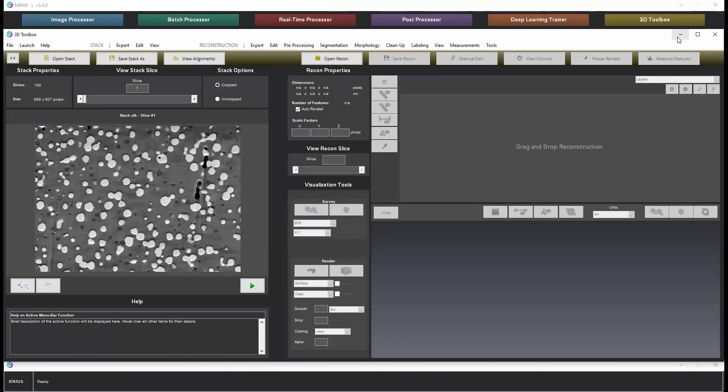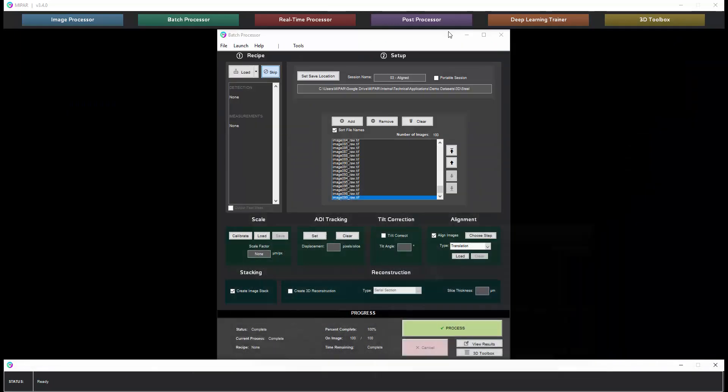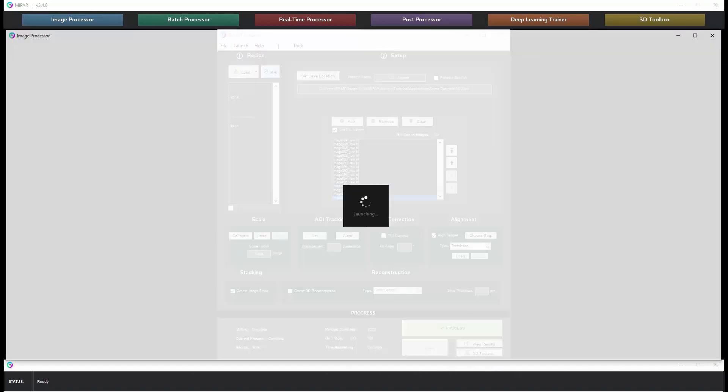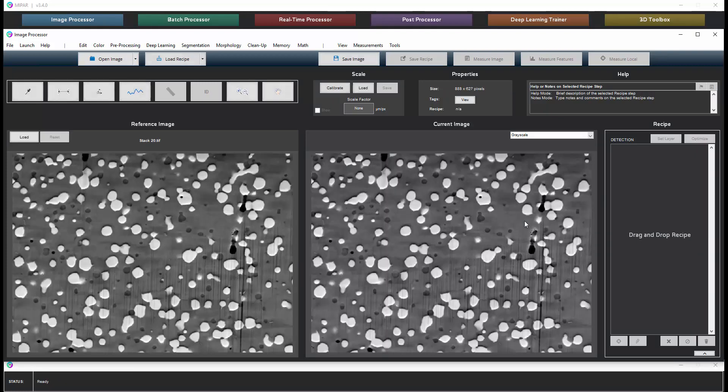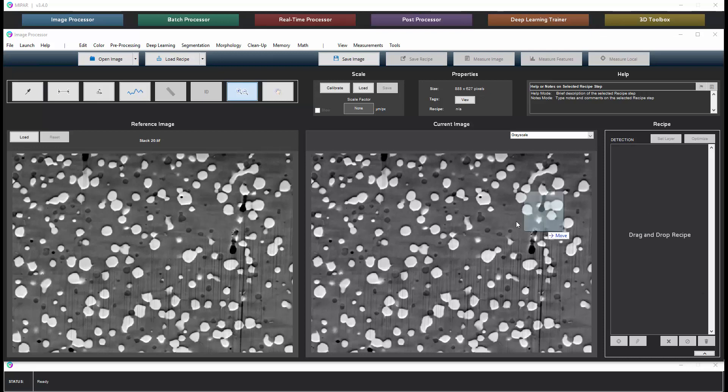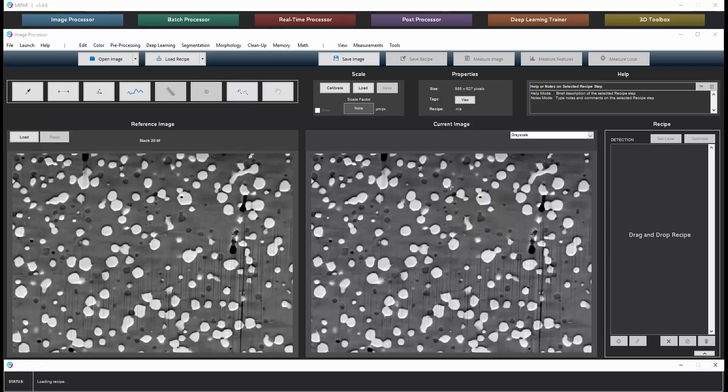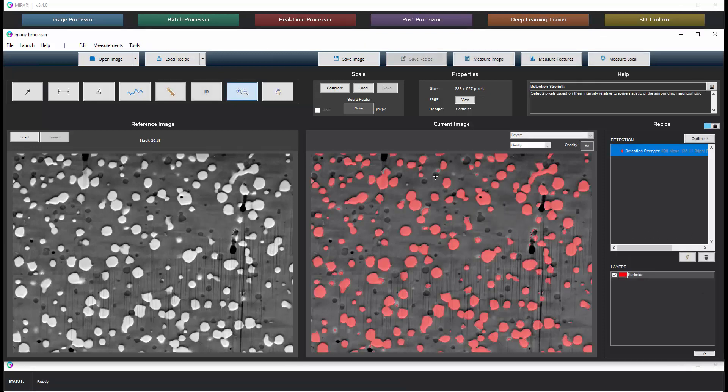So then let's go over to the image processor to take a look at the recipe. This has already been created. We'll open up one of the aligned images and then we'll choose the recipe to segment the particles.